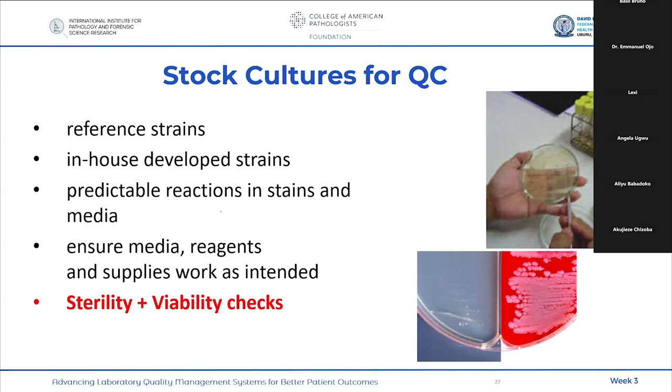Sterility means that the prepared media is not contaminated, and you incubate to check whether there will be unintended growth in the plate that is prepared. The viability check uses a reference strain to check the capability of the prepared media to support the growth of the intended organism.